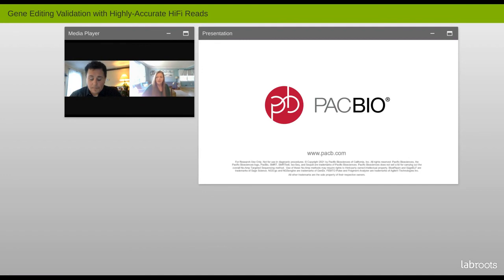Excellent. One last question is regarding CLIA or GLP. If you're sequencing for CLIA or GLP, is it the same or are there any differences when you're doing PacBio sequencing at that level? Well, you'd know a little bit more on that front than me. No, but the libraries are transferable across all that type of stuff. Once you've made that library, you have the option to do research-based or a few different things. And as I mentioned earlier, there were a couple different systems that you have offerings for, right? So high throughput, low throughput, and all that type of stuff. So you shouldn't run into anything once you've made libraries. But there are some of the other requirements, and again, why I send a lot of folks to GeneWiz is because you guys know how to do it really well.